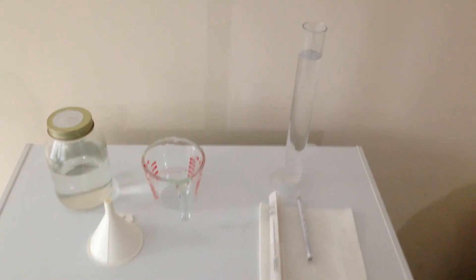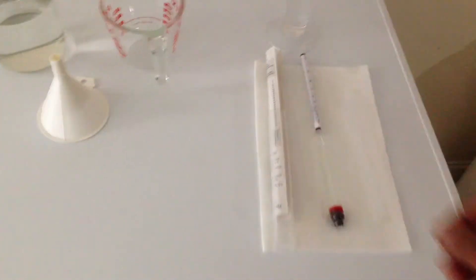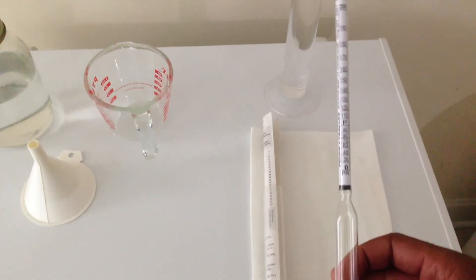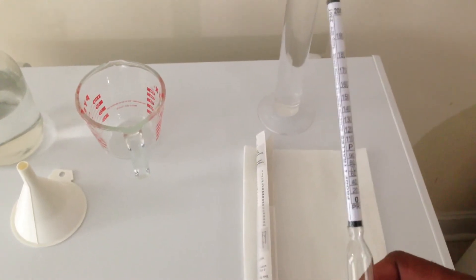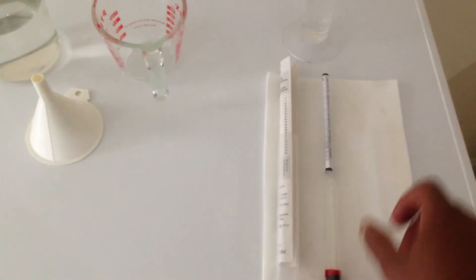Hello again YouTube. I'm back with some additional information for those that may want to try this. In order to test the proof or the percentage of your alcohol from the ethanol you produced, you're going to need some test equipment. The primary piece of equipment you're going to need is something called an alcohol hydrometer. This hydrometer is a tool that will allow you to test and find out the percentage of alcohol in your product — the alcohol by volume percentage and the proof. You can buy this off Amazon and various other places on the net.